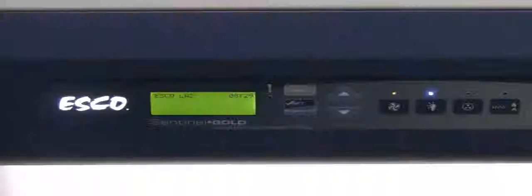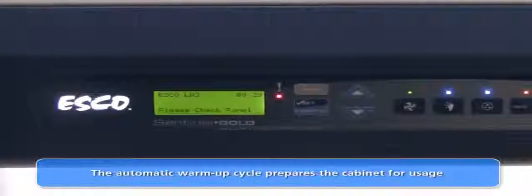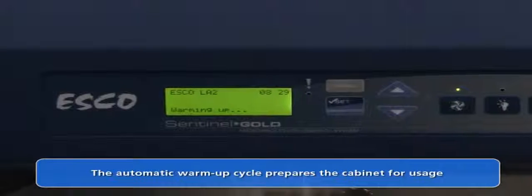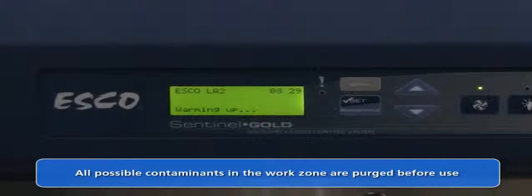LabCulture Class II Type A2 Biosafety Cabinets can be started by pressing the fan button, or when the quick start mode is chosen, by simply opening the sash to the operating height. The Sentinel Gold microprocessor control has a default warm-up cycle of 3 minutes, during which time the cabinet work zone is purged of all possible contaminants.